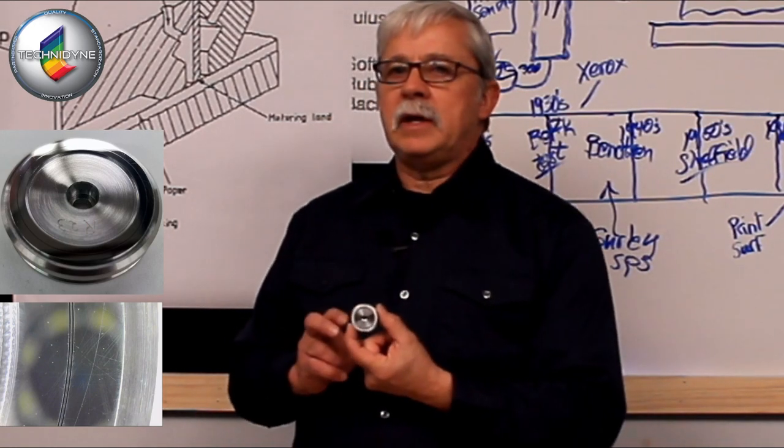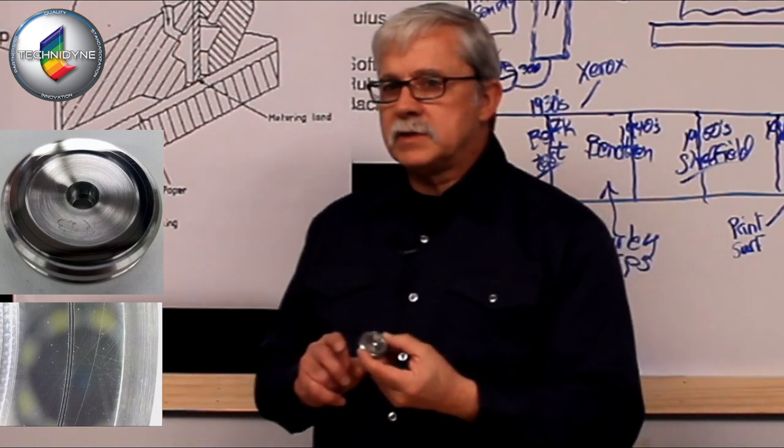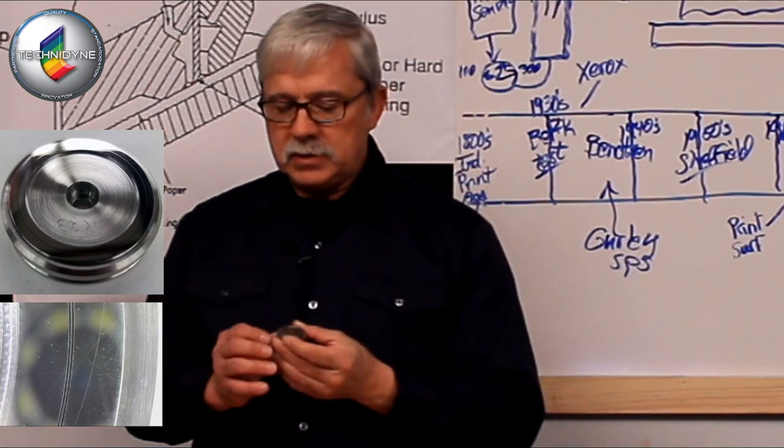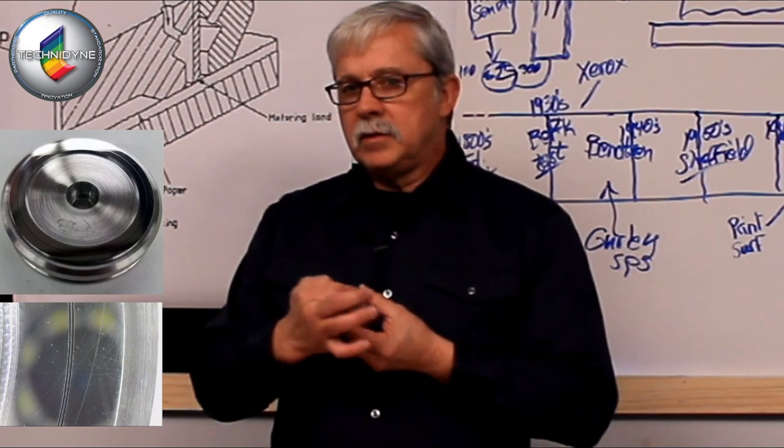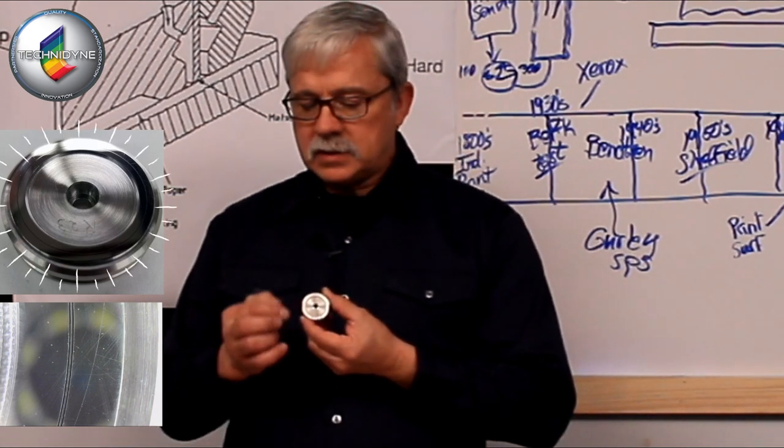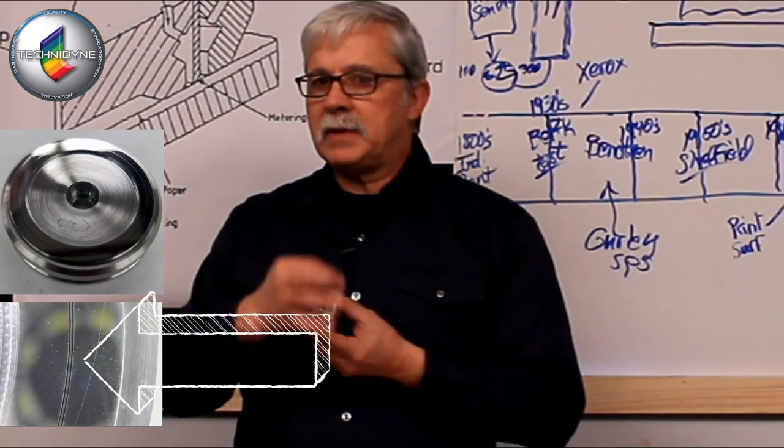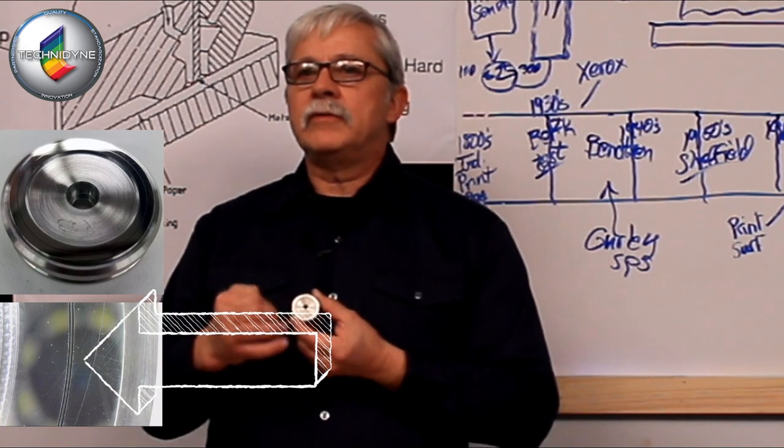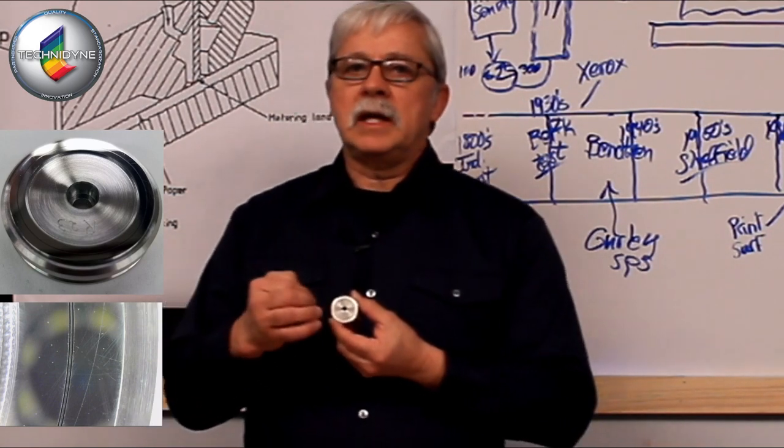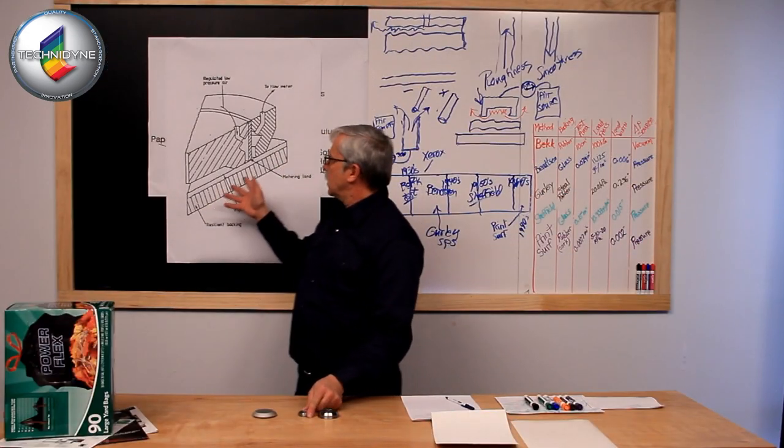This is an incomplete measurement head. But to give you an idea of the size of this measurement head and the gap, I don't know if you can see it, but there's a wide platen that's semi-polished. In between, within that platen, there's a groove that's cut out, and within that groove there is the metering land that's placed in the center.